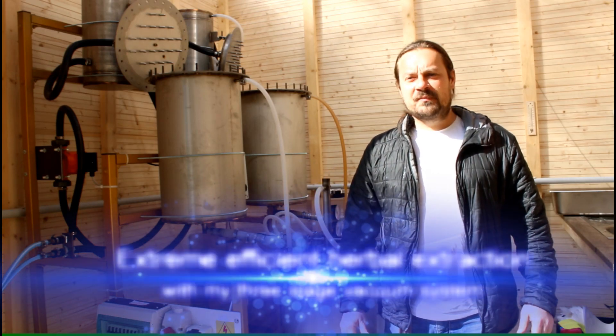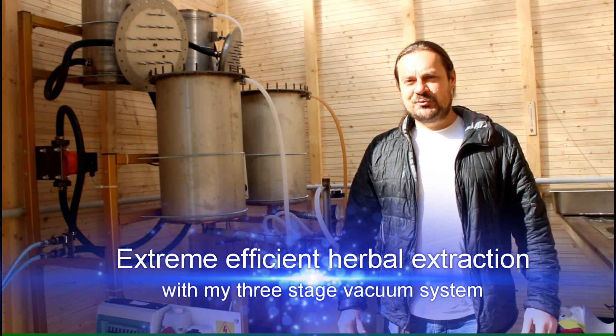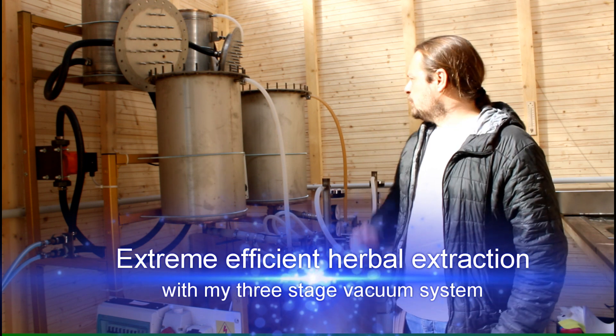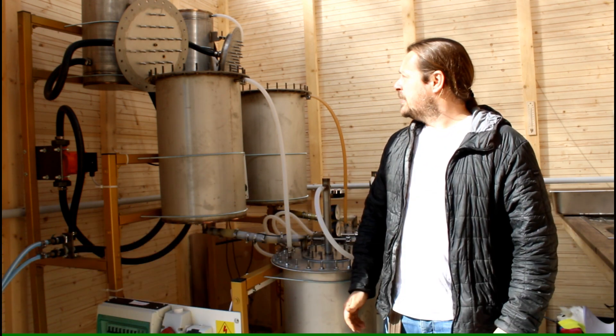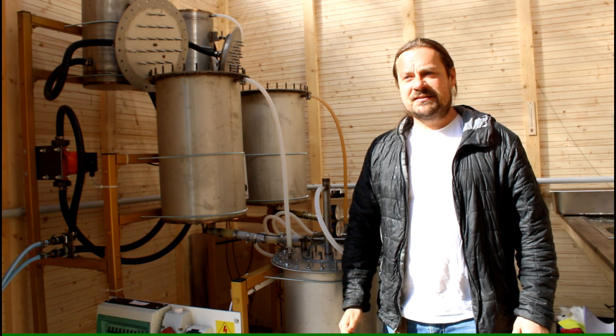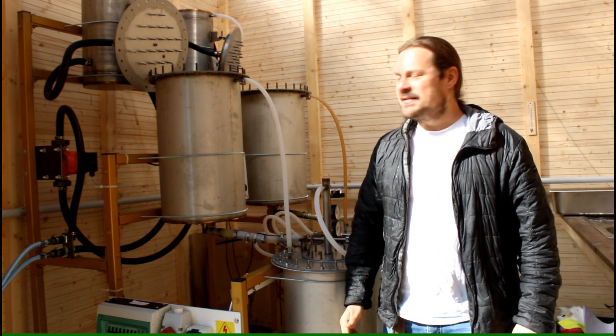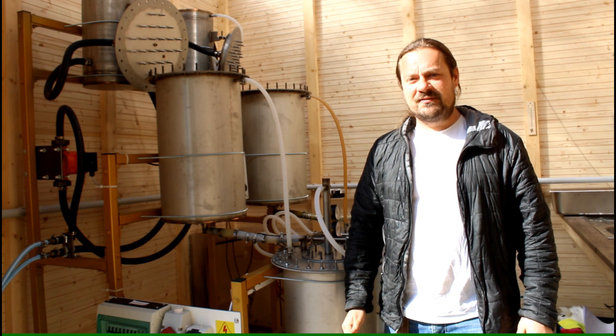Hello everyone! Today I want to present you my three-stage vacuum extractor for herbs. The machine is finished now since a couple of weeks and I am already extracting with it.